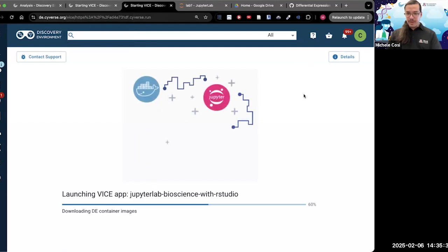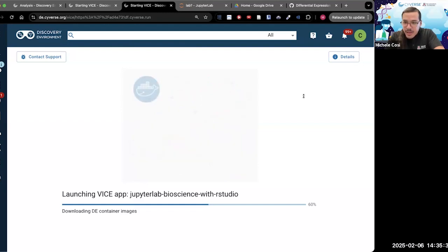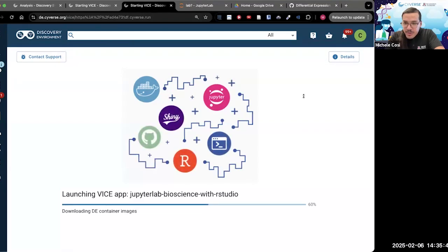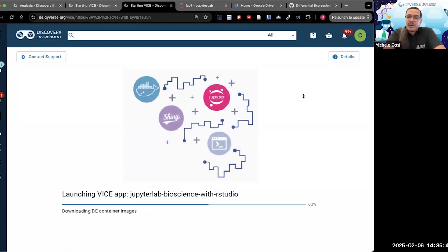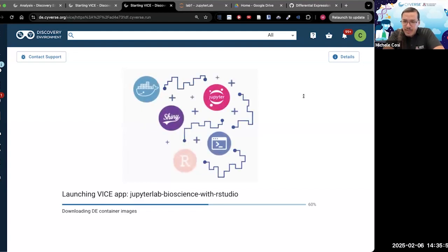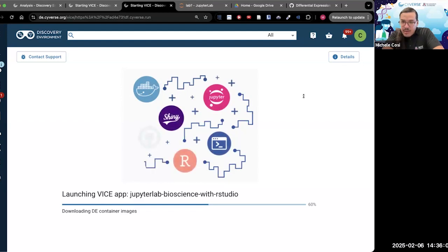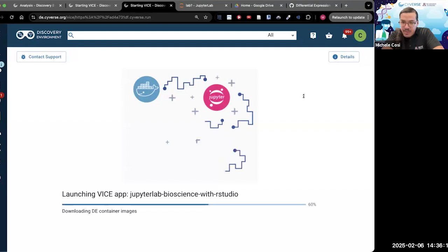Ooh, okay, hold on. I have a question related to Trim Galore, but it has to do with RRBS FASTQ files. They have an RRBS flag, but I'm not sure if I should use it, as I don't know if my data was digested using MspI, which is a prerequisite in the Trim Galore documentation. I'm not familiar with this pipeline. If anyone could tell me where I should find how the samples were digested, or if the sequencing machine type used will tell me how it is digested. I believe it was an Illumina HiSeq 2000. This is also public data. Thank you.